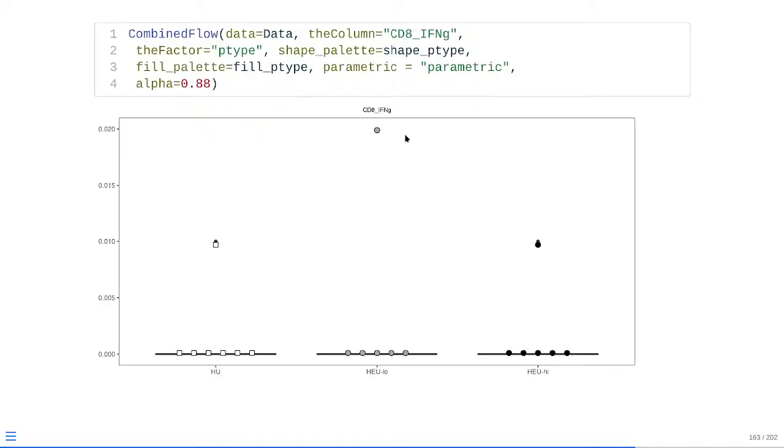But one thing that's worth noting is you can see there's only these little outlier dots that are well and truly above the rest of the cells being compared. But if you think about it, we're going to be trying to draw lines and then putting p-values above the lines between these three different groups. So where these lines are going to be drawn is important because we don't want it being drawn in such a way that we're hiding the actual data by where we have pasted our p-value. So we really should identify what the max value in terms of our y-axis is so that any lines being drawn get drawn above it and not placed on top of data, obscuring what we're able to see.